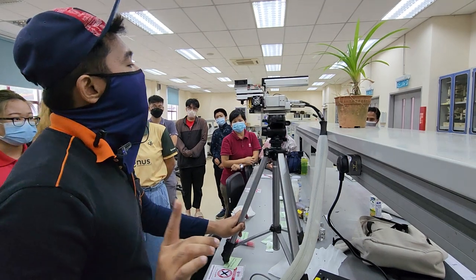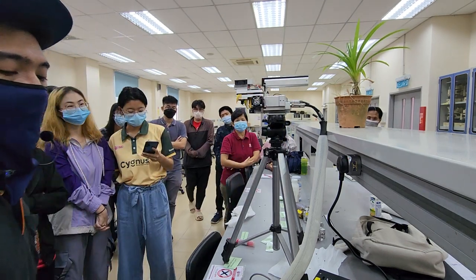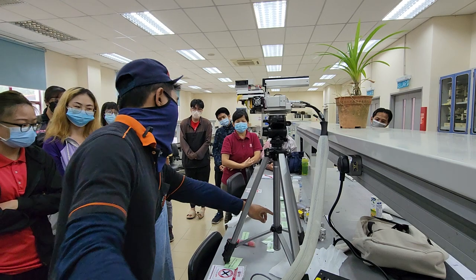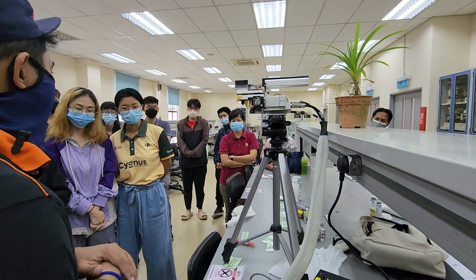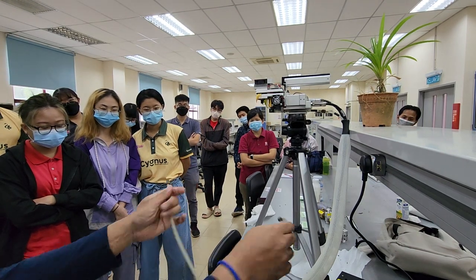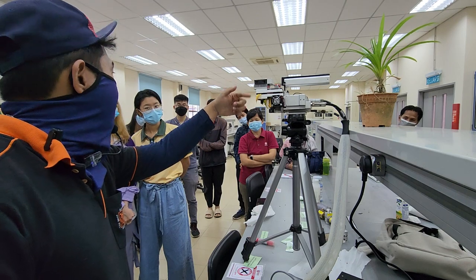Other thing that you need to know is about how does it work? So when you clamp your leaf like this, make sure it's touching this thermocouple, you tell the machine the known amount of CO2. That is called CO2 reference. Remember, you give the machine an external CO2 source, for example, 500 ppm, parts per million of CO2. So this CO2 is going to exit this machine using this cable here, going all the way to this chamber. And there's a fan going on in here.